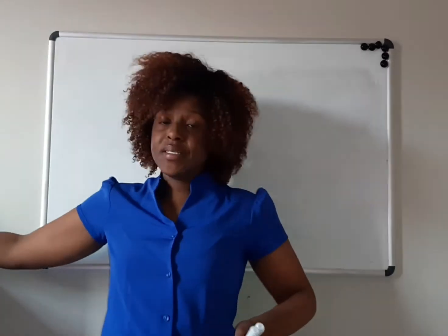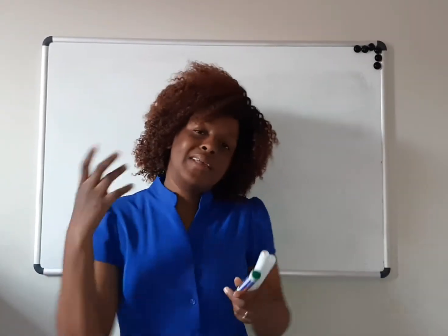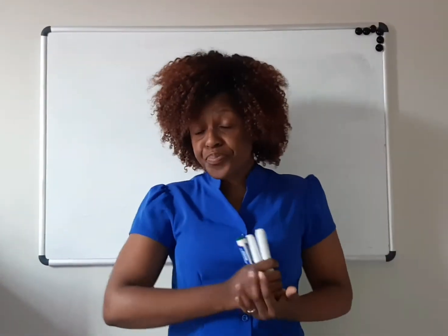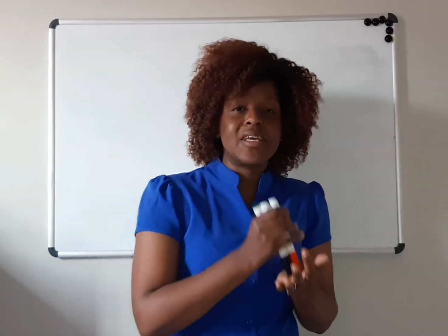Because we said they are directly proportional, we'll be talking about a linear graph. Each and every instrument, depending on the lab's policy or the supplier's policy, will have to be calibrated before you can use it. What does it mean to be calibrated?